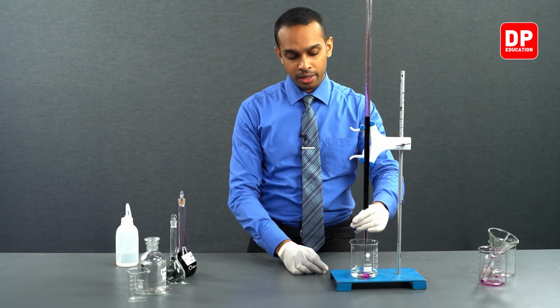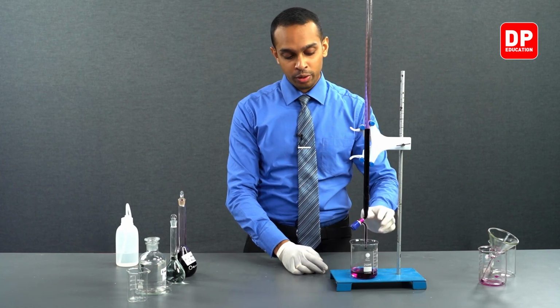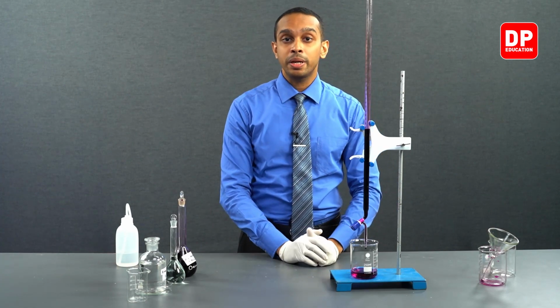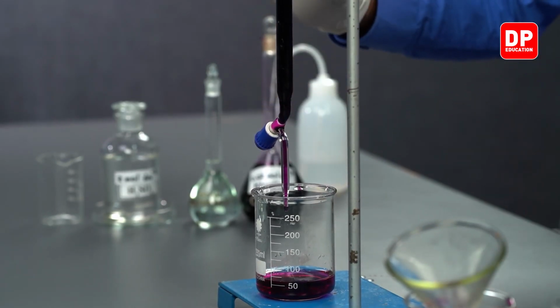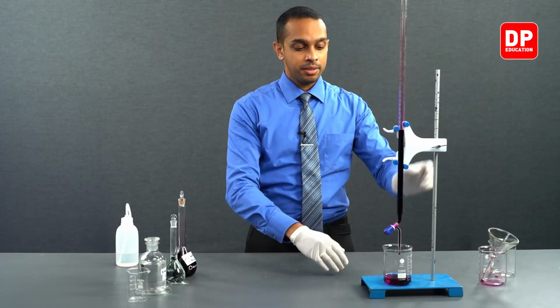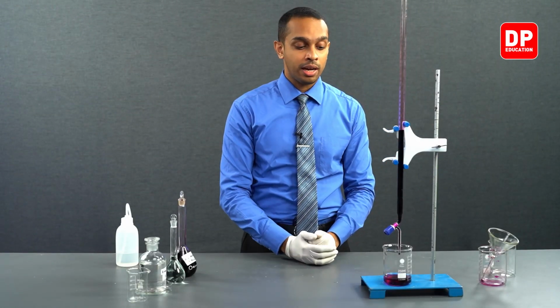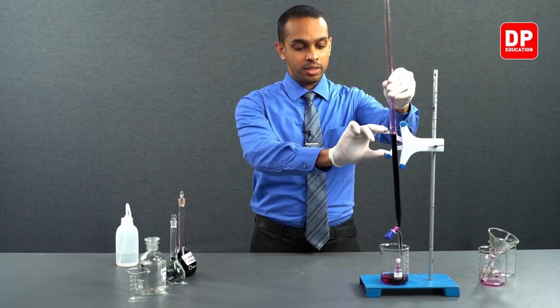So I will open it rapidly, allow some solution to run through. So now I know even the tip is completely washed. Afterwards, I can remove this burette from the stand and continue to wash it like I washed it before. So let's remove the burette from the stand.